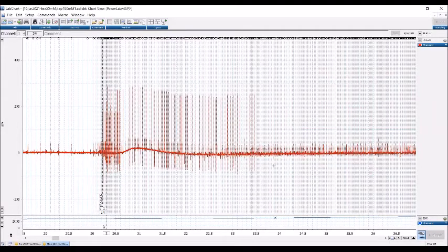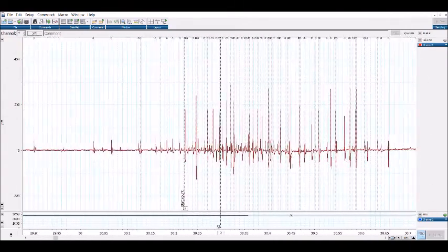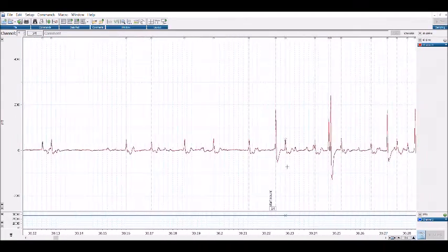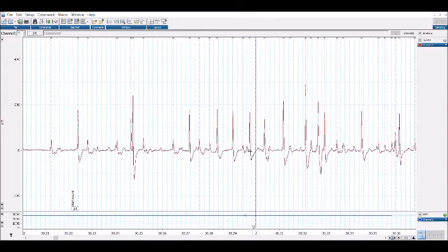And then you can see that it starts with the lines. You can see it's starting to count. Zoom in. So I analyze at 2 to 1. And then you're going to find wherever it started. And you can generally tell when you start seeing these dynamic spots of where it started.